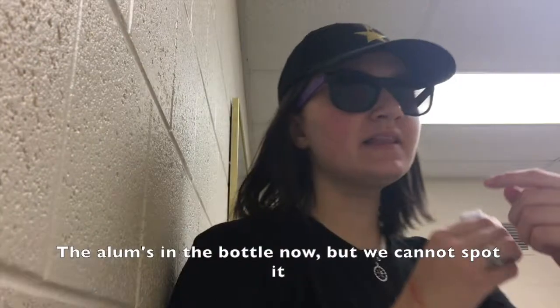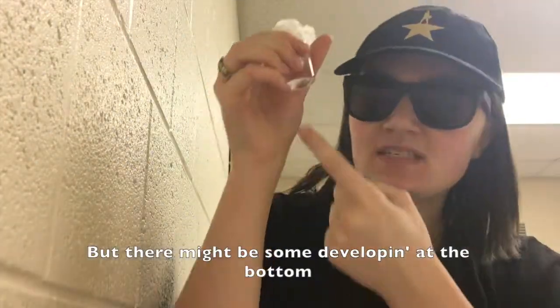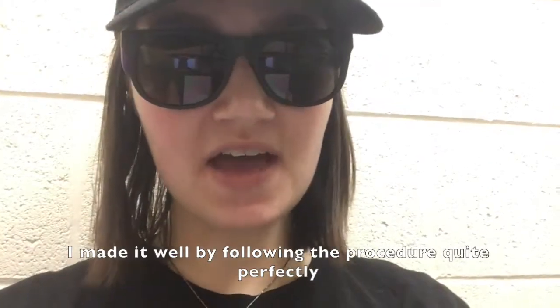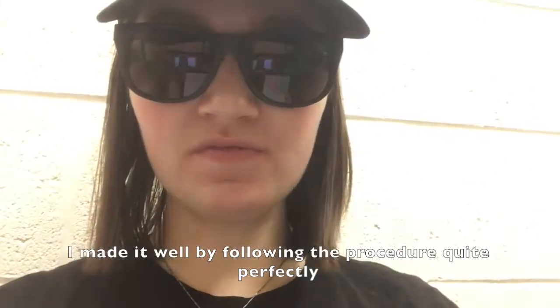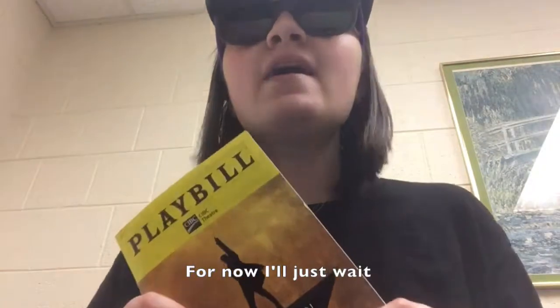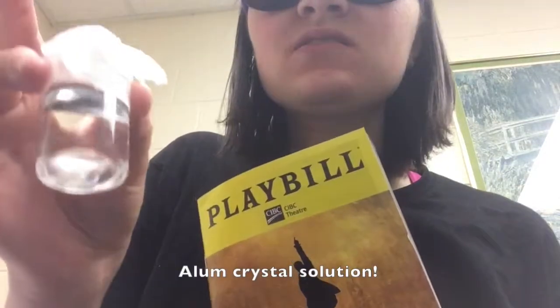Oh, alum's in this bottle now, but we cannot spot it. There might be something developing at the bottom. I still have some faith that my alum will be formed. I made it well by following the procedure quite perfectly, and now I'll just try to understand why there's a reason it's not there. For now I'll just wait. What did we make here? Alum crystal solution.